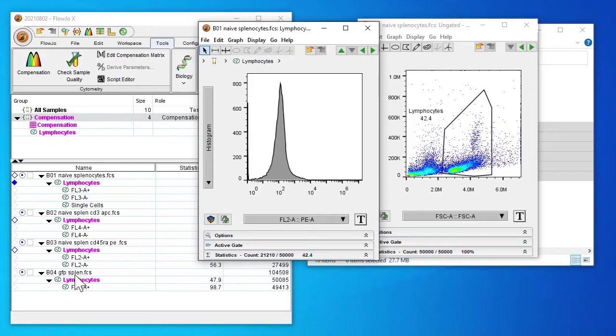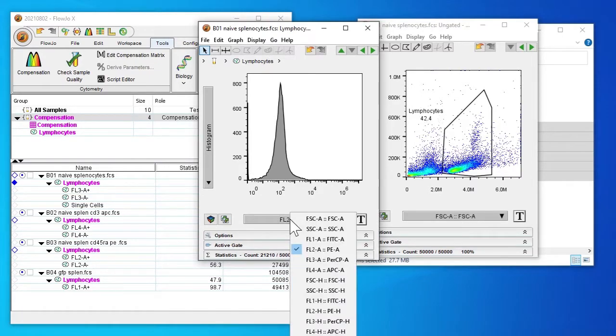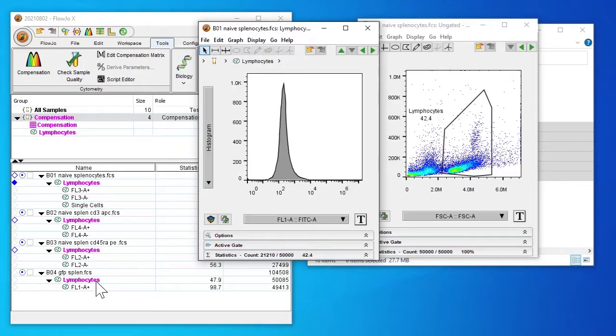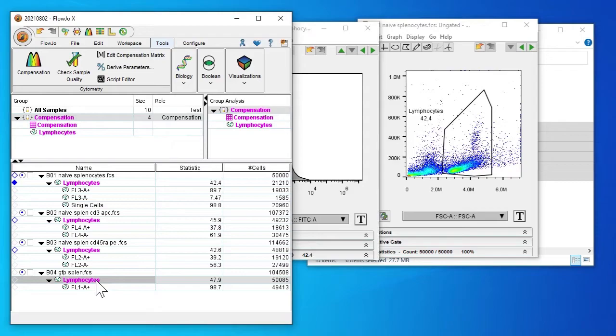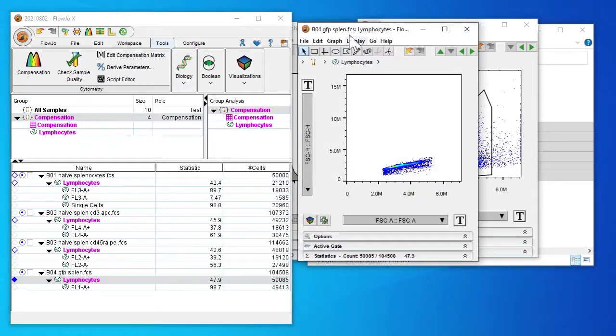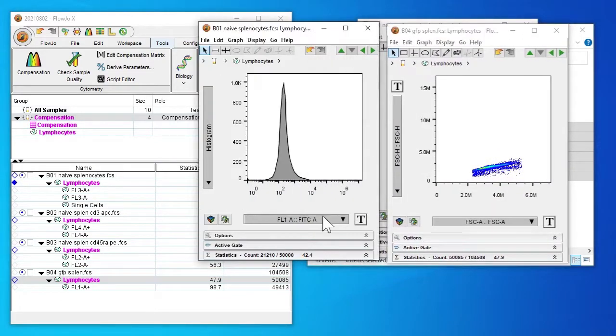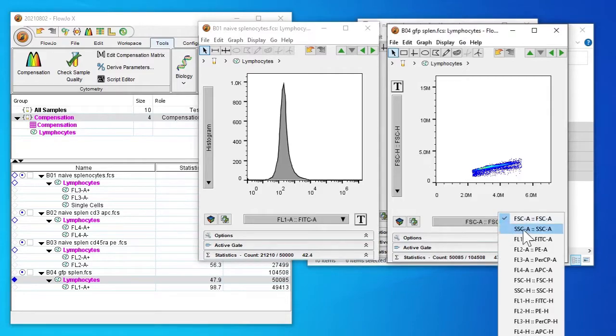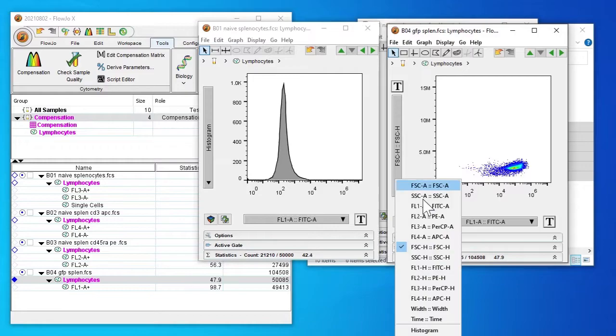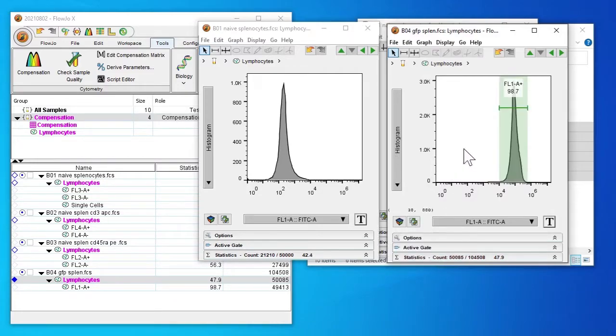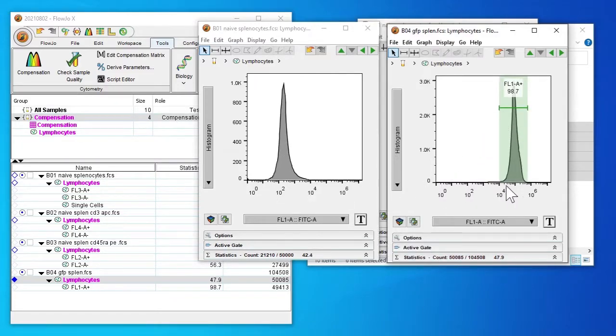Next we're going to check out GFP positive signal. We'll change our negative non-stain control to FITC. Double click on lymphocytes, change this to histogram. We see that the majority of our sample is FITC GFP positive.